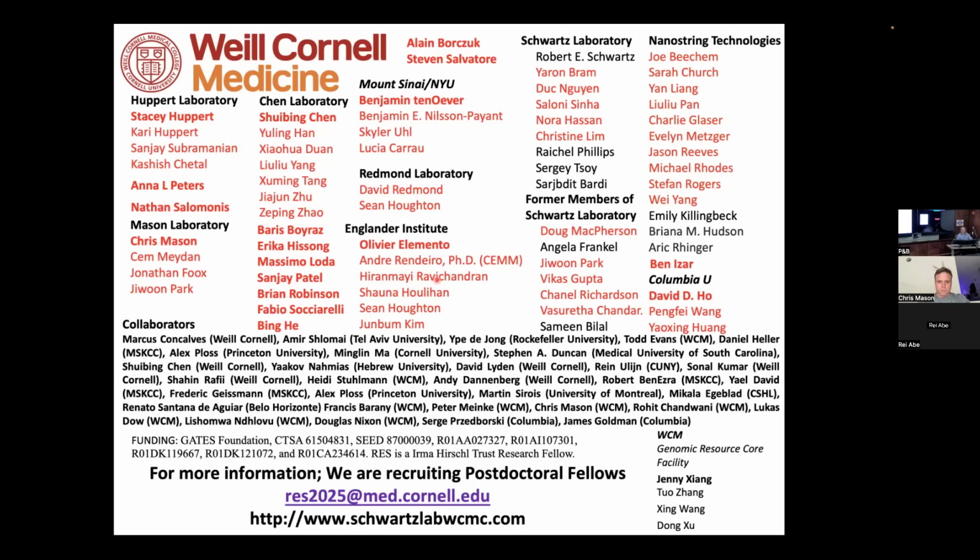So this is the problem. If you think about this, that is multicellular. You're doing a multicellular analysis. So in a tissue like the liver, or frankly, if you're doing diffuse B-cell lymphoma, that's a big chunk of the lymph node that you're looking at. But I think it's great. Those lymph nodes are large enough that you'll still have some heterogeneity within that. Yeah, a ton.